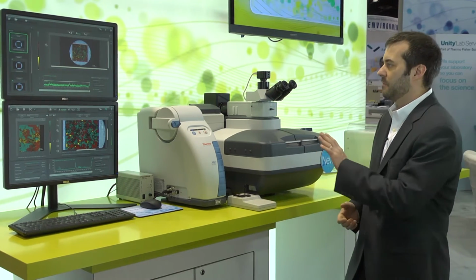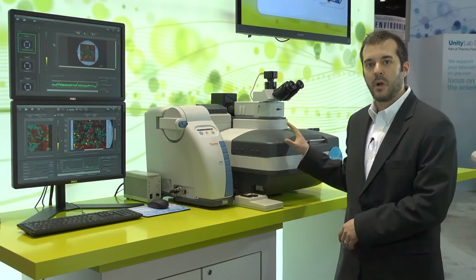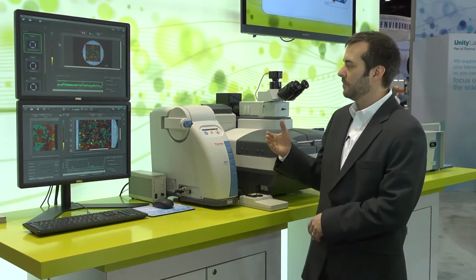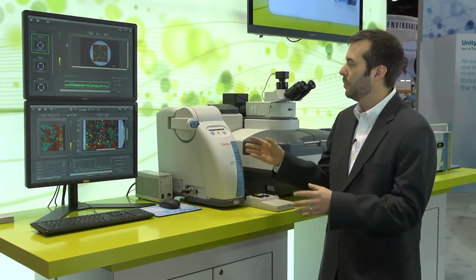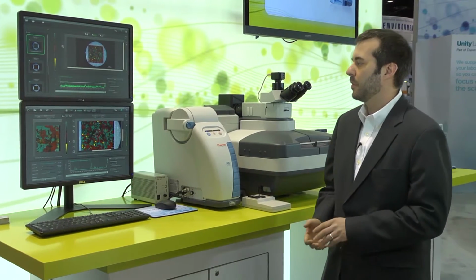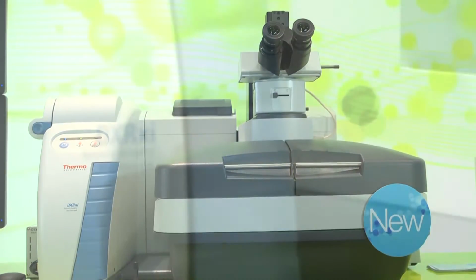The secret is a visually driven interface that takes advantage of very powerful hardware to really focus on what matters. That is visual interpretation of high-performance spectral data pulled into one picture. We're advancing research for applied researchers in academia all the way through process and product development.